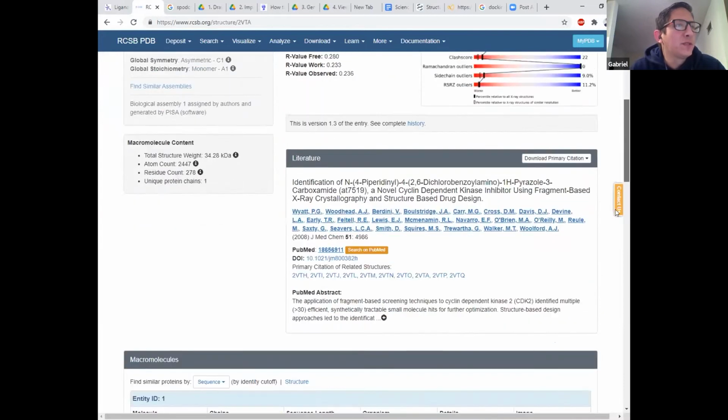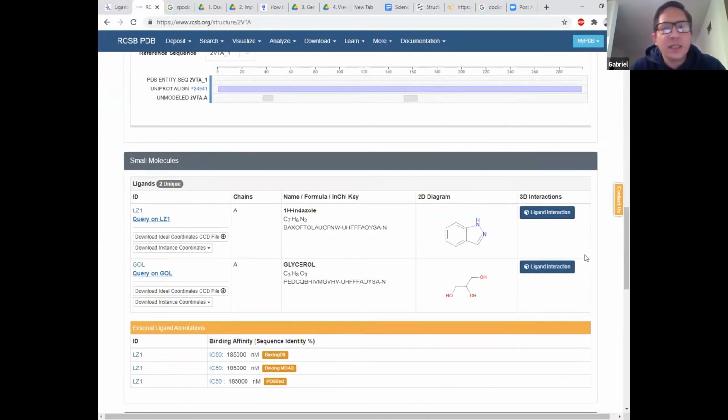You can find that this molecule, CDK2, was co-crystallized with 2 ligands, small molecules. For the ligands, we give a 3 letters code. So for proteins it is 4 letters, for ligands it is a 3 letters code.